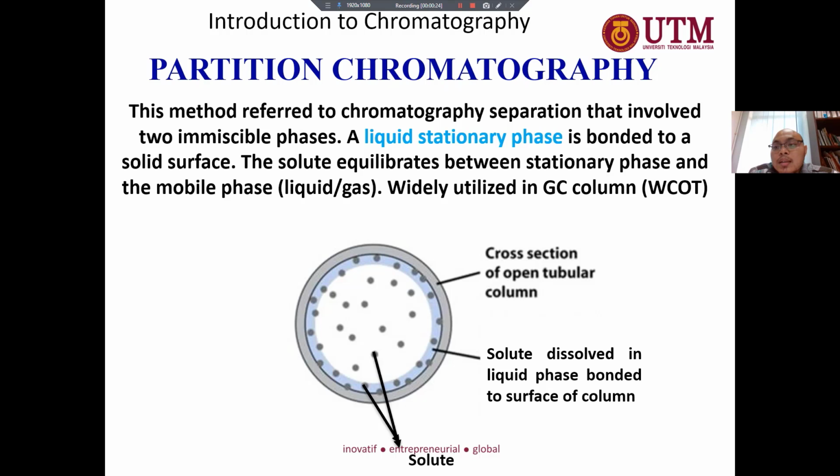In most references, they mention partition chromatography involves liquid-liquid separation. But in modern separation techniques today, partition chromatography is when the separation involves two immiscible phases.